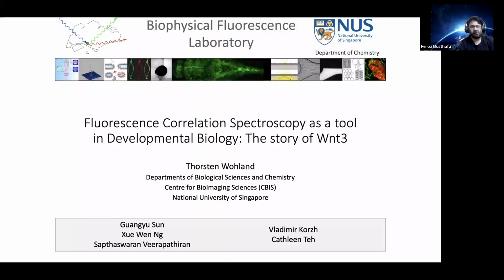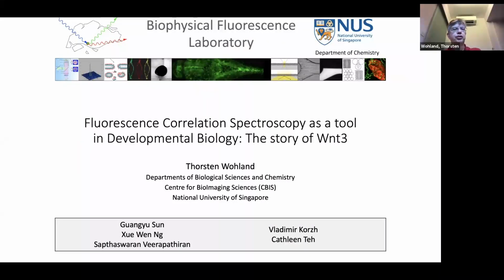Okay, so the second talk was supposed to be a little bit more of a research talk. So I thought I'd give you an idea about fluorescence correlation spectroscopy as a tool, as we use it at least in developmental biology in zebrafish. And that is a story of Wnt3, a molecule we've been working on for quite some time.